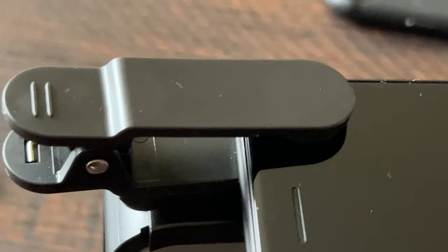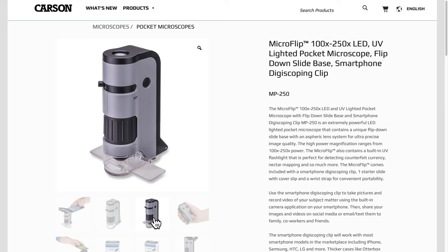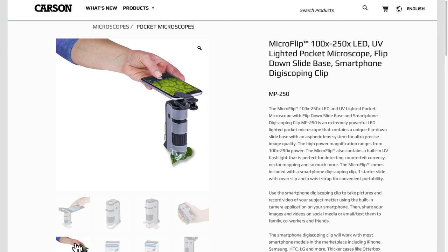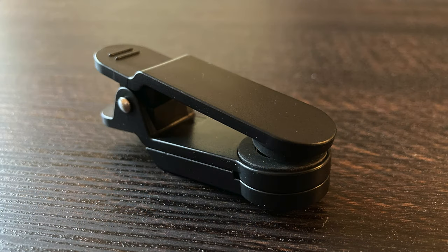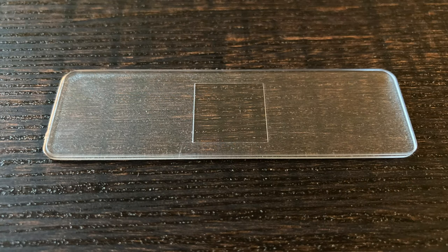The problem is that there are a few things to do to get a good picture. You have to balance the microscope and the smartphone while manually adjusting the focus and the zoom. What's included in the box? On the left there's the smartphone clip, which is the primary reason I bought this device — I was looking for a quick and easy way to take microscopic images with my iPhone. A blank microscope slide was also included, which can really help with positioning your subject.